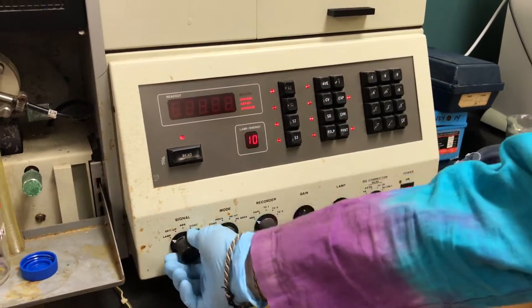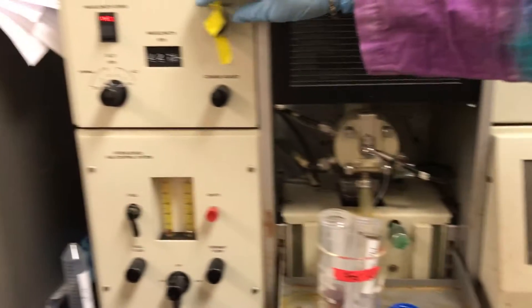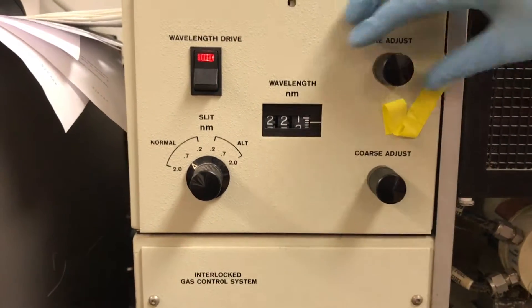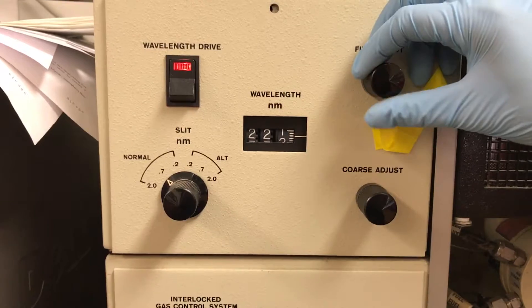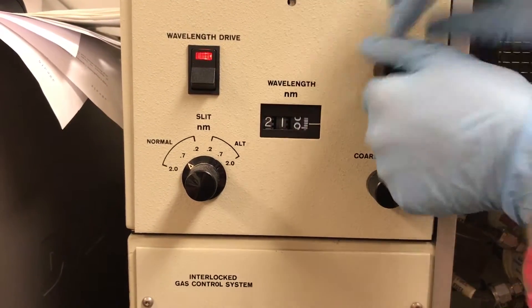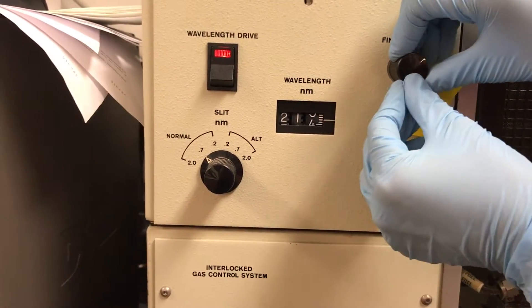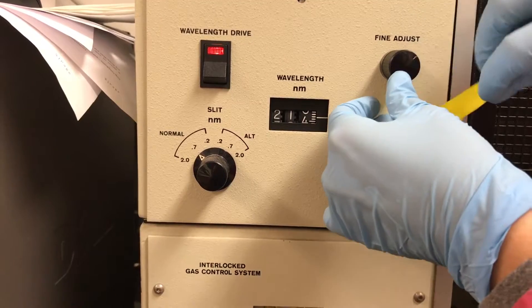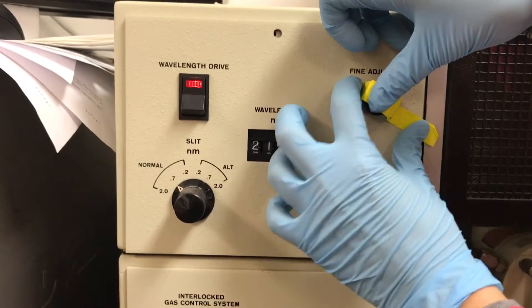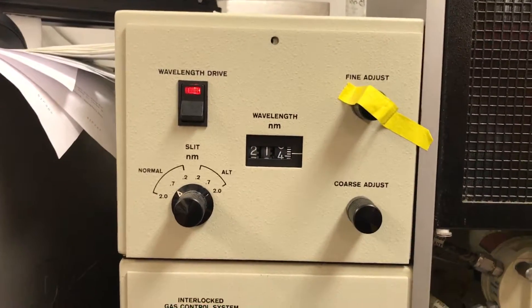Next, change the signal knob to setup. Come over here and adjust the wavelength for whatever wavelength your element absorbs at. In this case, zinc absorbs at 213.9. Use the very, very sophisticated stabilization tape to hold it in place.